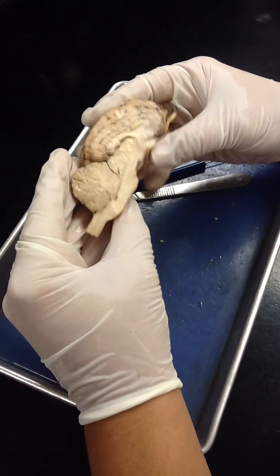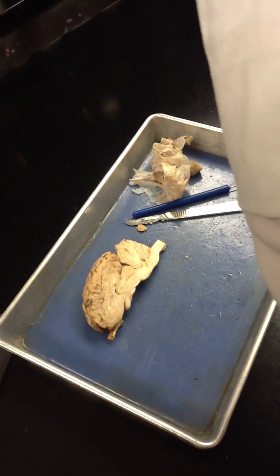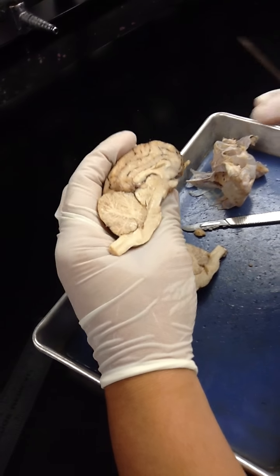I know. Okay. So if you guys in the front want to come over here, because I'm doing the half. I cut it in half. Okay. It looks like chicken. Now this part of your brain. I want you to note.